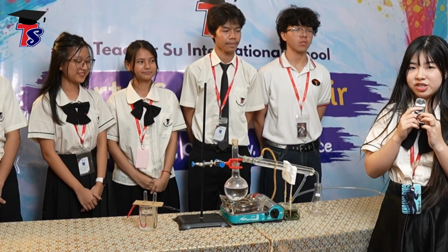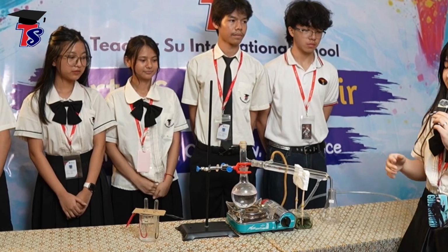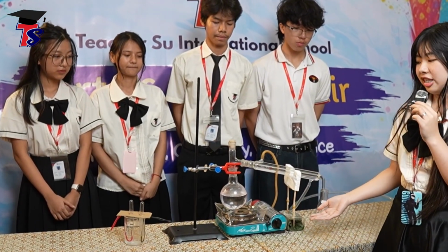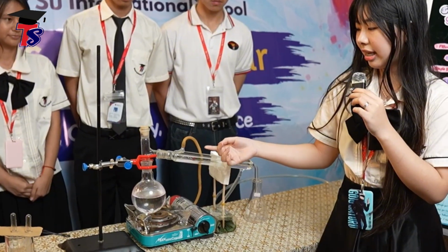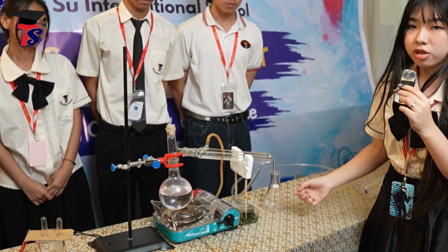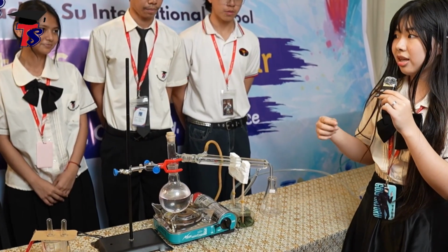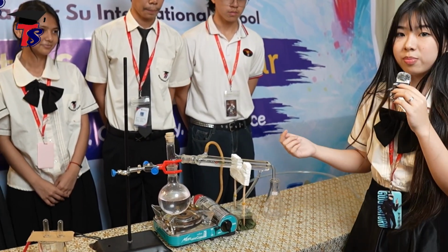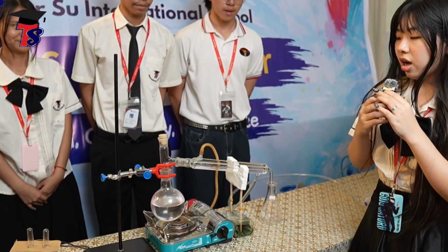Today, we will be demonstrating simple distillation as stated earlier. So this is the whole setup for simple distillation. We have a round bottom flask, a joint to connect the condenser and the flask, and a conical flask to collect the pure water, the product produced. And this is the water out, and this is water in.